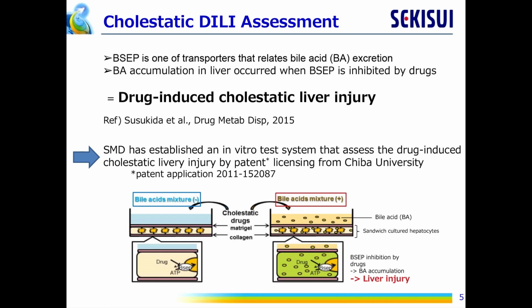In our body, bile acids that are imported into cells are excreted to bile canaliculi by transporters like BSEP. BSEP inhibition alone doesn't necessarily mean there will be bile acid buildup though. Sometimes the body has mechanisms to compensate and export bile if BSEP cannot, which is why we look at a representative test system to see if BSEP inhibition does result in bile acid accumulation and toxicity.